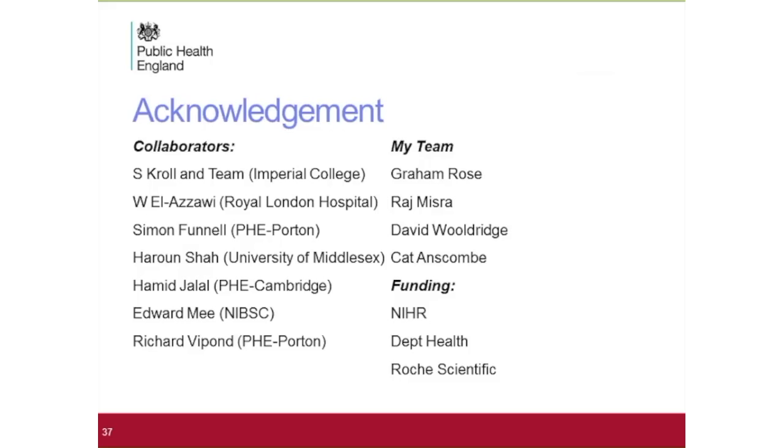And obviously, if you are looking for fungi or for phages that will be at a far less abundance within these samples, you may wish to go for a slightly larger sample. But ideally, homogenizing as soon as possible. And some colleagues' work I haven't presented because it was from different groups, suggested that if you remove the surface of the fecal samples and concentrate on the core within the matrix, the human matrix, you would get a better and more consistent recovery.